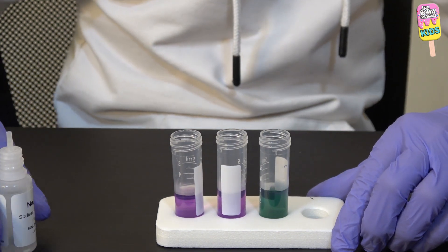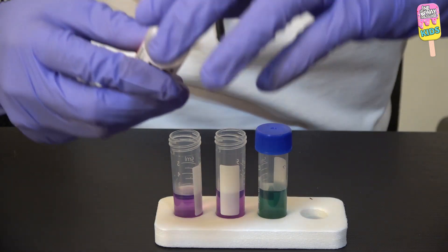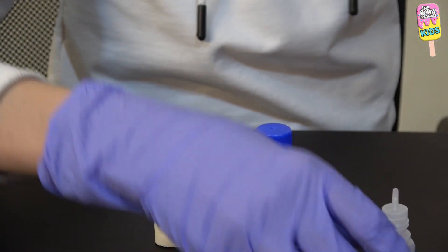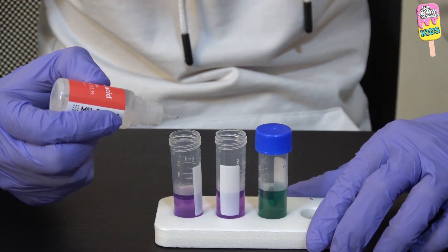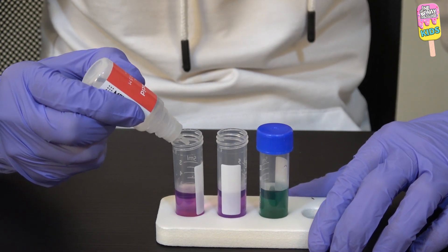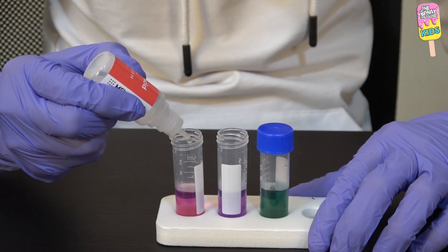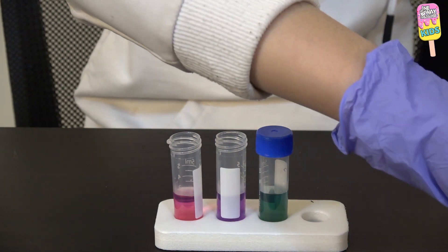It turned green — that's so cool! And now five drops of citric acid into the rightmost test tube. Bismillah. One, two, three, four, and five. Wow, that turned pink!